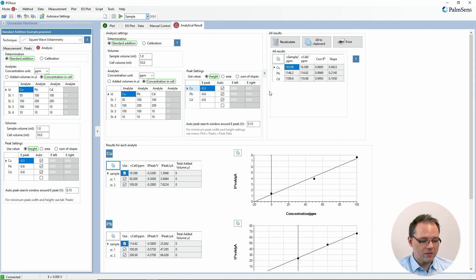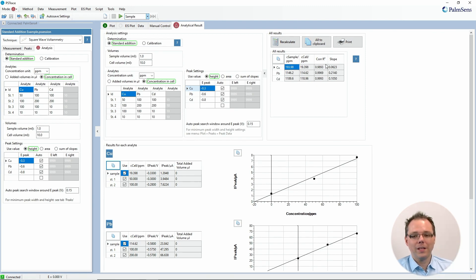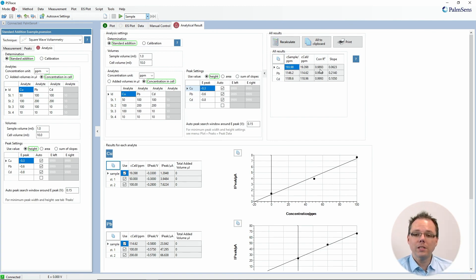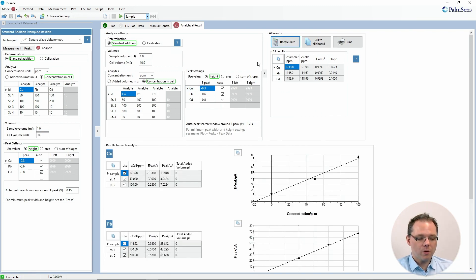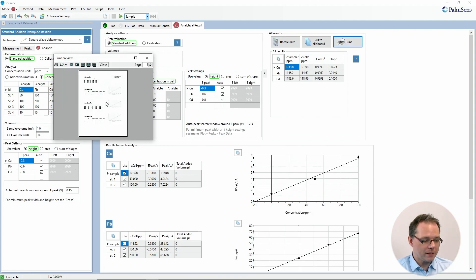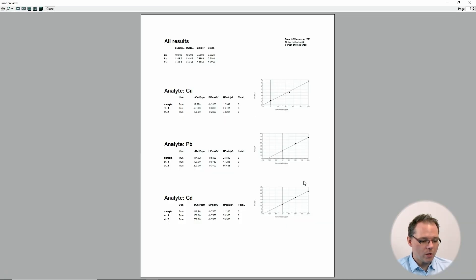You can copy-paste values from the table by pushing the button to the clipboard. What most people like is the overview showing for each analyte the concentration in the sample and the concentration in the cell. You also get information about the linear regression made for your standard addition: the R-squared to tell you about the quality of your measurement, and the slope which tells you about the sensitivity. Every time you change something, just press recalculate. You can also press the print button to make a small report that you can print and have available for your lab book.